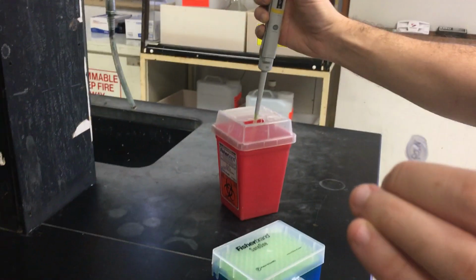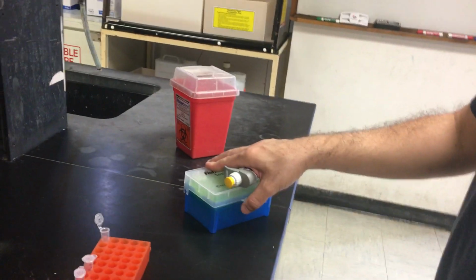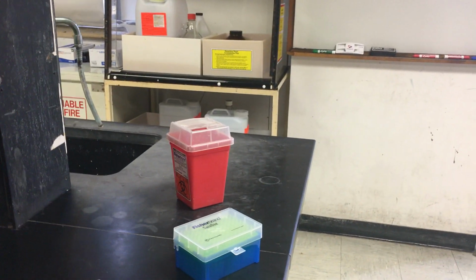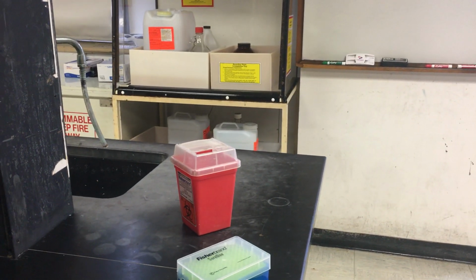Remember, these are proteins that you are adding, so you don't want to make any bubbles. So very carefully, you go up and down without making any. Now, the next restriction enzyme, BamHI, we're not going to add because, as you remember, we're doing a single digest of PstI. So that dash on the third line down for BamHI represents that we're not adding this enzyme.